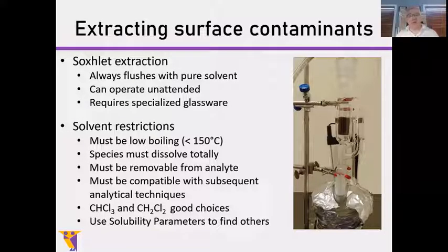The nice thing here is that you're always flushing with fresh solvent because the solvent vapor that comes up from the reservoir is always pure. So this ensures that whatever's in there is going to get a pretty good washing, and you can run this unattended. It requires some specialized glassware, but it's not really that expensive.